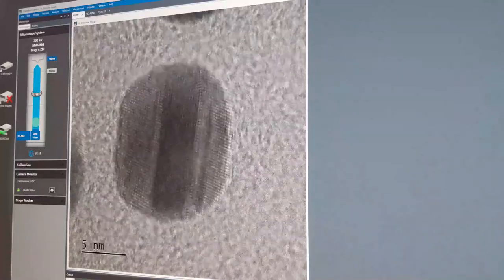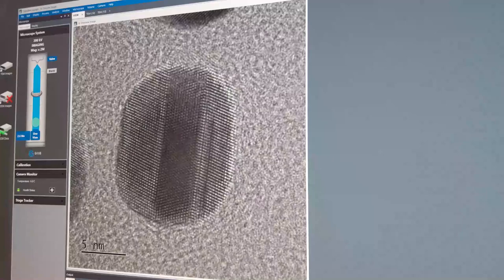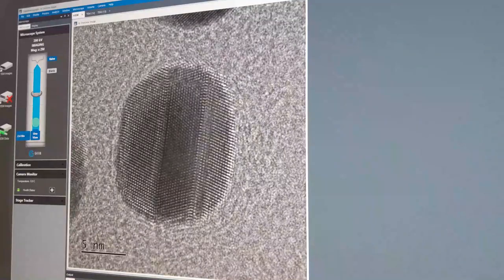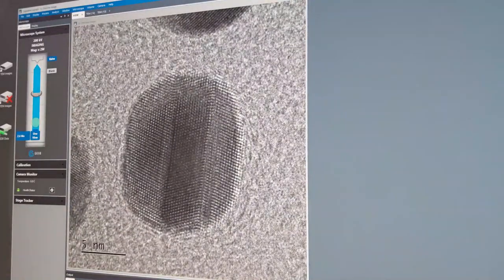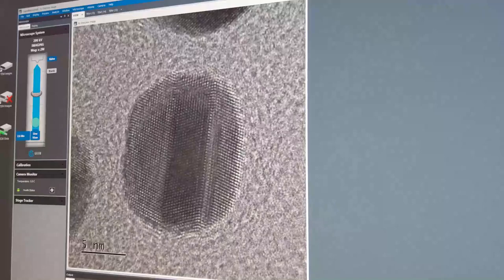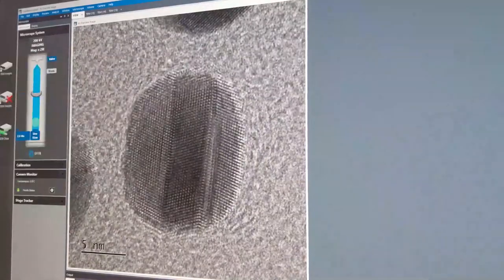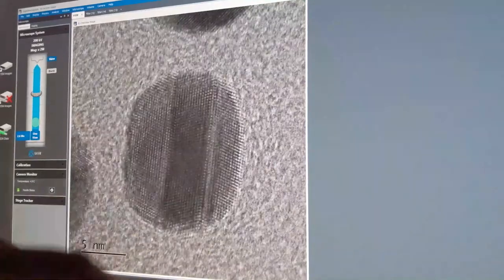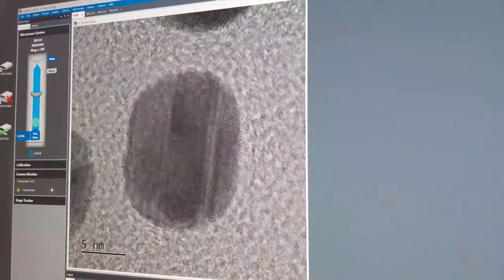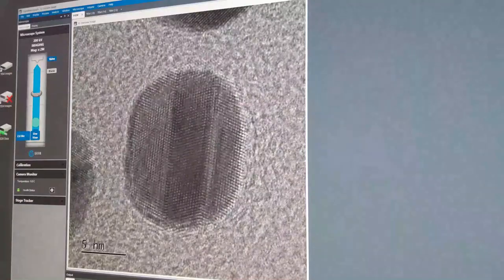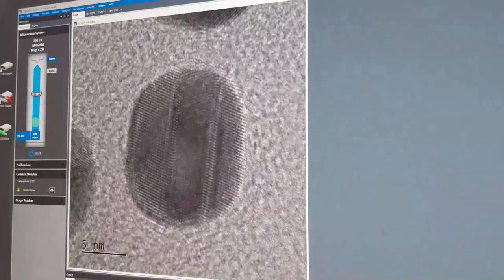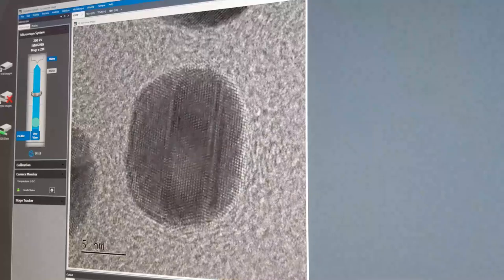We're back to 2 million times magnification, and I'm going to take an image of this nanoparticle. In this nanoparticle, we can see that the atoms are arranged in this region in a different way to how they're arranged in this other region, and at the boundary of the two regions the change is abrupt. We call such changes a stacking fault — this is a type of defect in the crystal — and it's due to the way that the nanoparticles are formed, how they grow, and the kinetics involved in that.